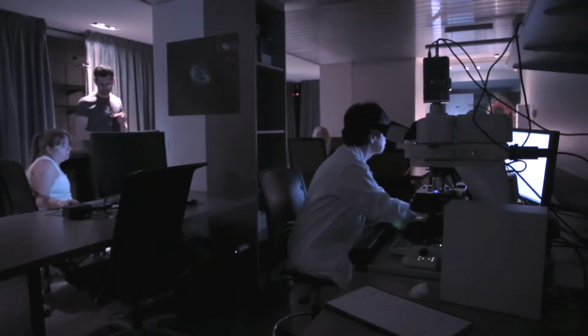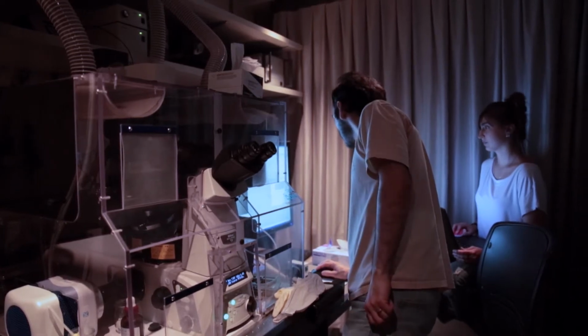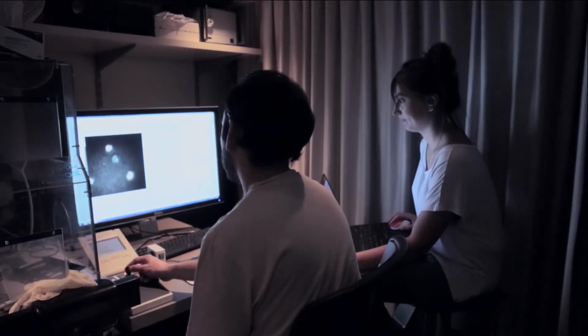So I'm Xavier Heiligenstein, a postdoc at Institut Curie for the past 5 years now, and I've been recruited after my PhD to establish and develop methods of correlative light and electron microscopy for Institut Curie, and also within the development at that time of the France bioimaging infrastructure. The idea was to make a method that would be user-friendly and usable by most scientists from Institut Curie, but also from everywhere in France, and being able to propose them a way to come, do the experiment, and go back with easy results to get.